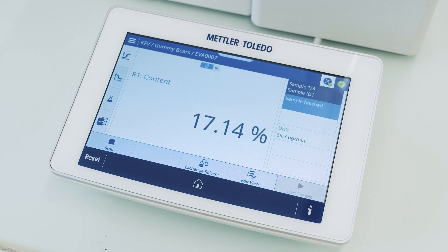Now that the titration is done, we received our result which can be seen on the screen, and it is well within the expected range.